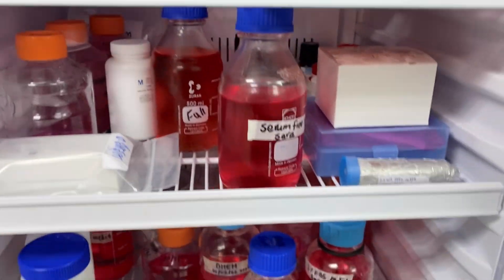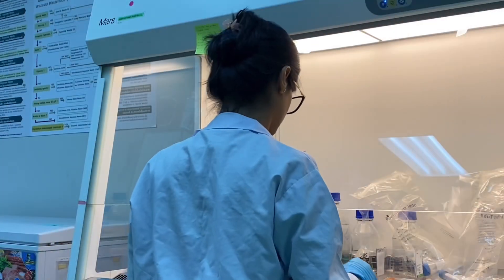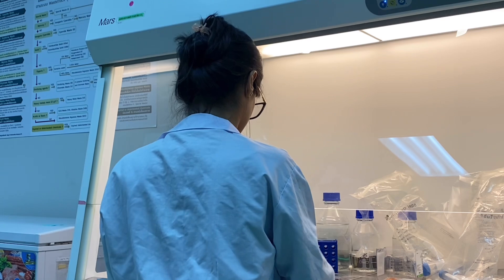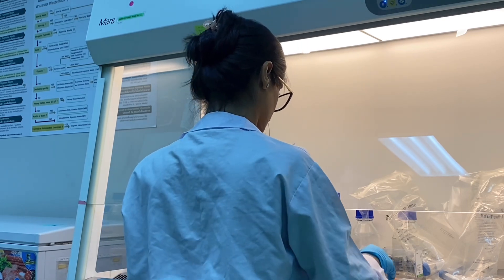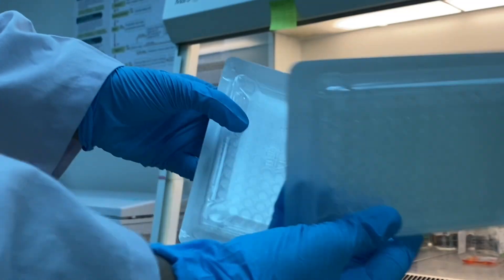Now I'm going to take out my trypsin and full media to water bath them. After that I'm going to remove all the media from the plates and replace it with 2 ml of trypsin so that it can detach the cells from the bottom of the plate. I will incubate it for about five minutes. These are the 96-well plates that I'm using for the MTT assay.